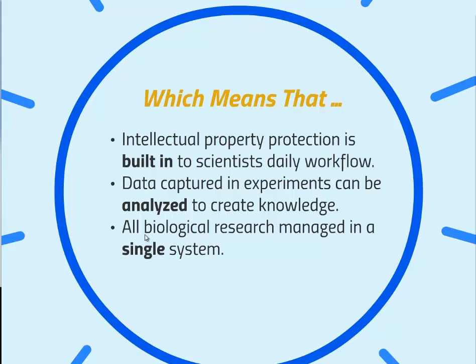All of this again means that we have good intellectual property protection within a system which manages your workflow, allows you to record all of your structured and unstructured information, which allows you maximal use and keep the value of that data and use it for all of your biological research.